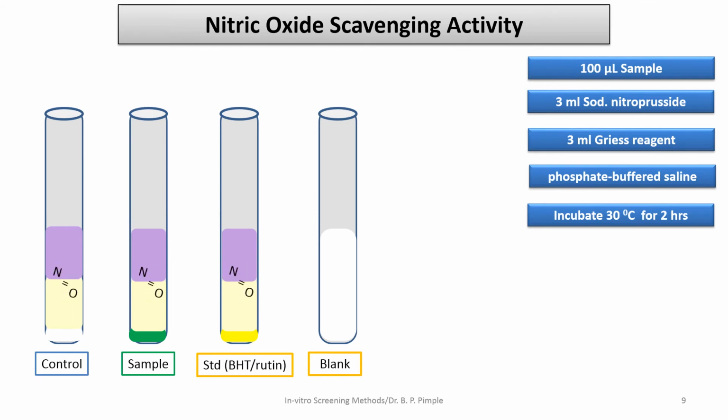Now, during their incubation period, these test tubes can come in contact with oxygen. See, oxygen comes in, and this oxygen is able to oxidize the solution. So, if your test tube has antioxidants in it, these antioxidants are able to kick off the oxygen.